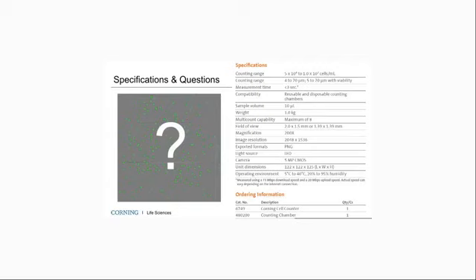There's another question. I'll take that one. Can poor slide quality give you false results? Definitely. Poor slide quality, or one of those bright line hemocytometers, that's the silvered surface that was invented to make it easier for us humans to do cell counting using a microscope. That reflection can sometimes confuse the algorithm a little bit. If you have an old beat up hemocytometer, it's probably not going to be a great count. I've seen that during the development phase of this product, but we give you a brand new no line one, and that works fine. Brand new ones with the dark lines also work fantastic. We did a lot of validation on that. There are a couple of application notes that I published, available on our website: counting of murine CAR T cells, and counting of PBMCs. In both of those instances, I used a gridded hemocytometer to verify that the counts, using manual counting versus the Corning cell counter, had no statistical differences between either the counts or the viabilities.